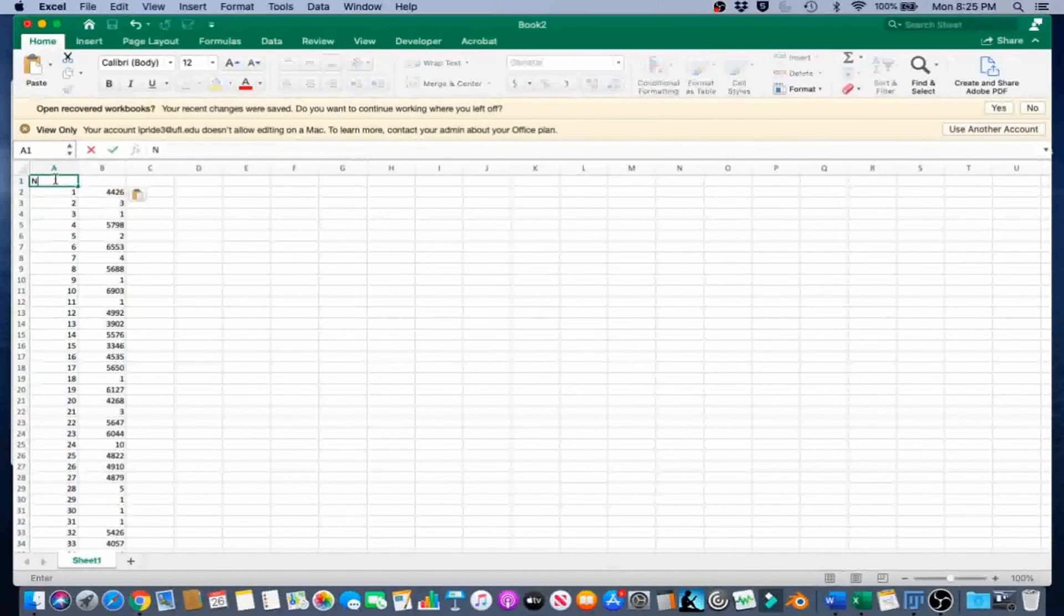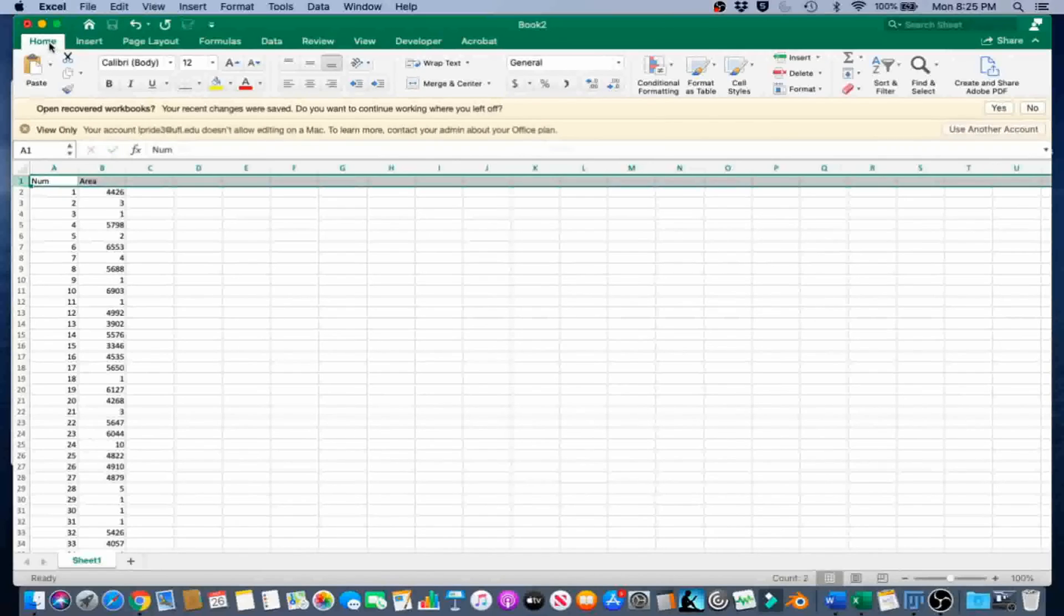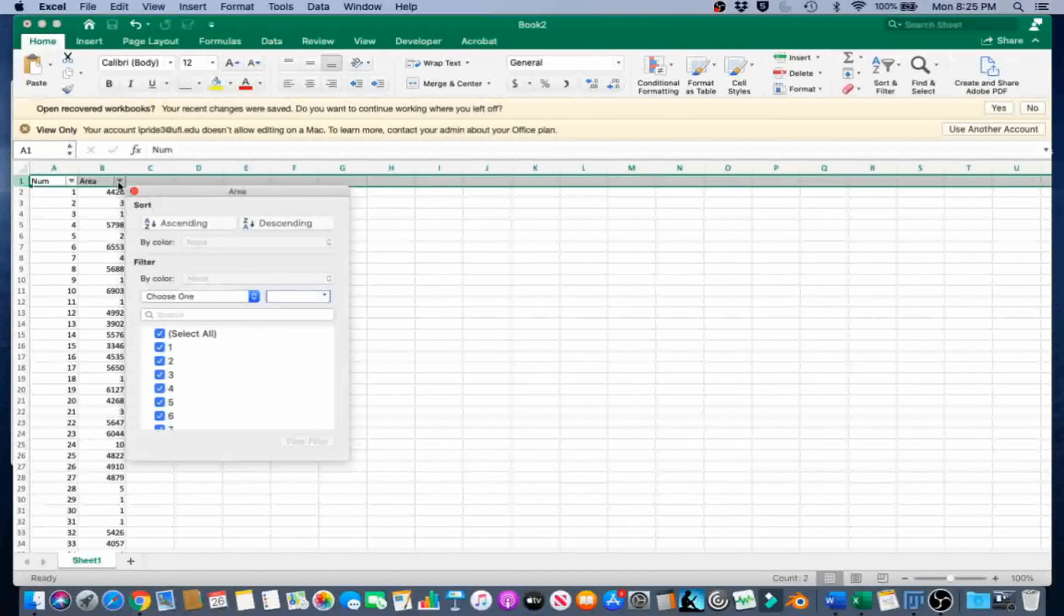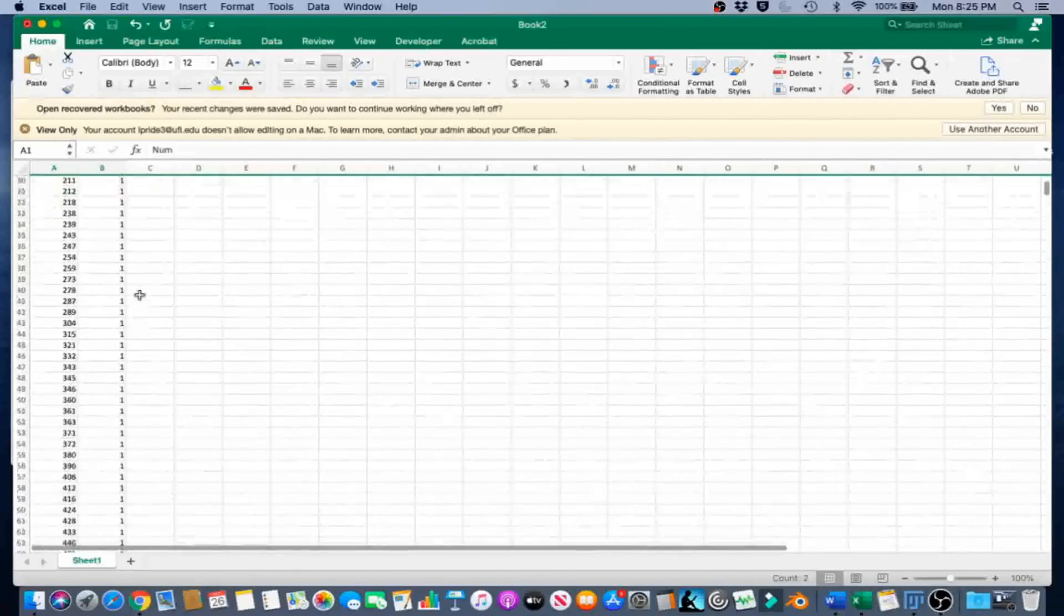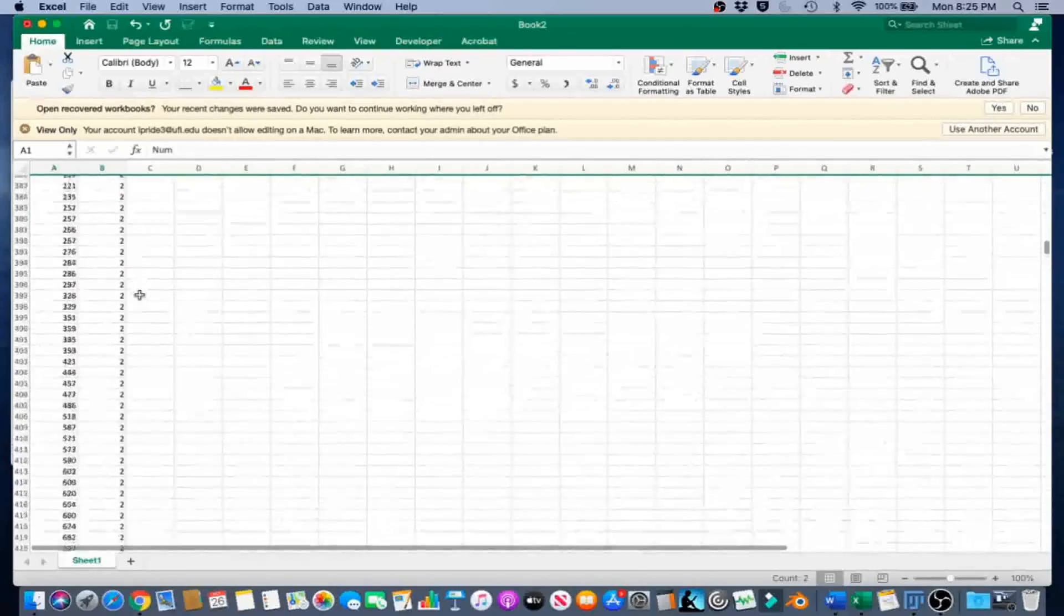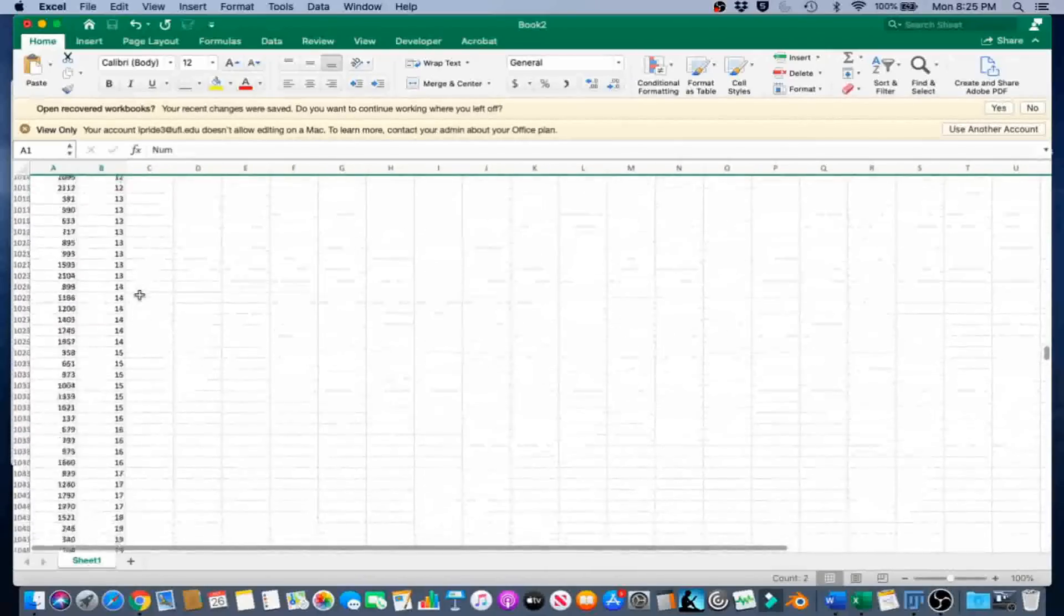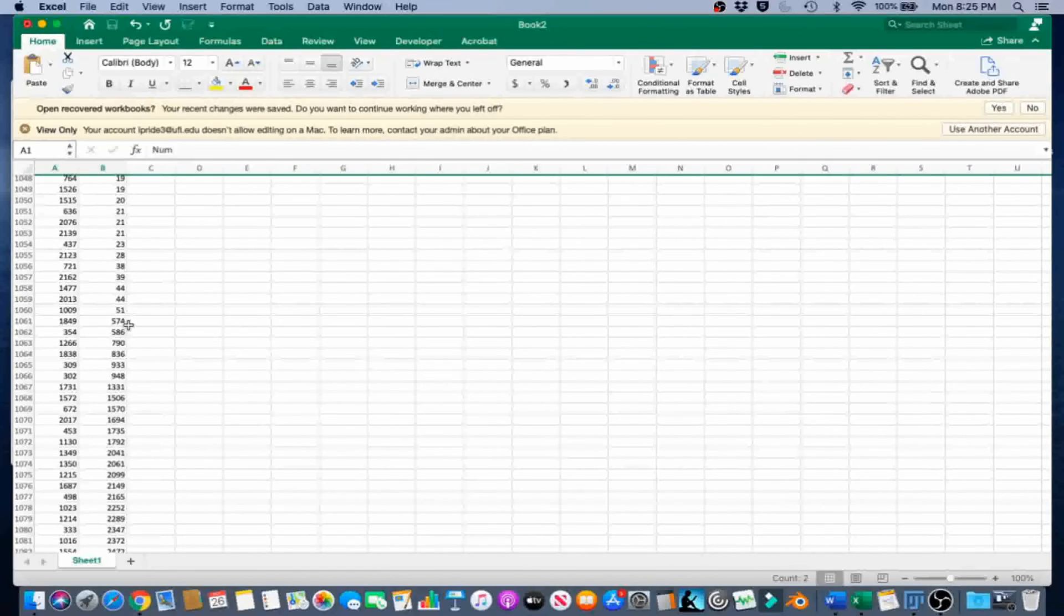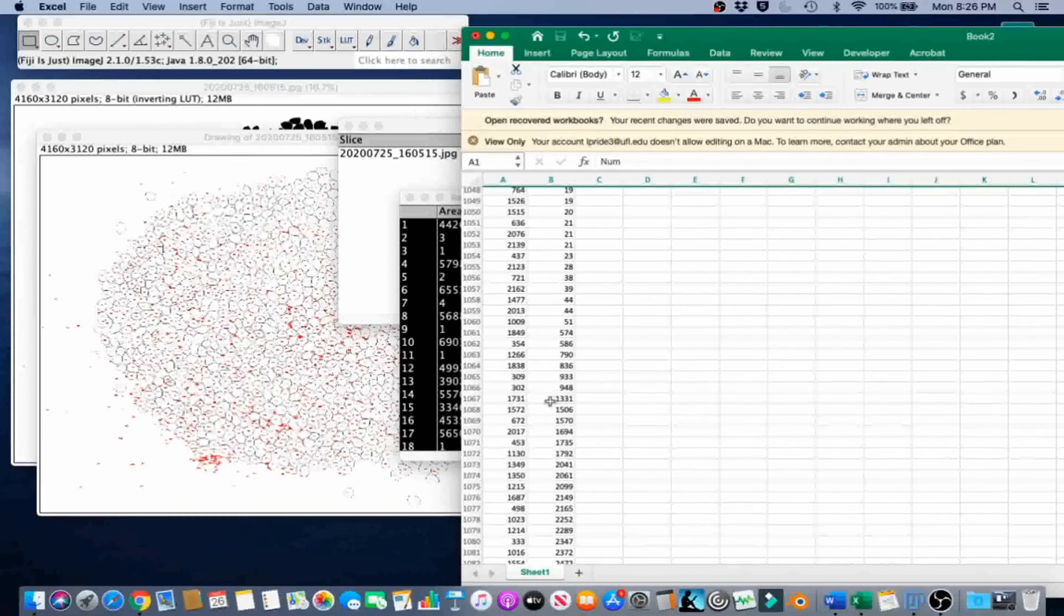I'm going to call this Num. Call this Area. And in the Home tab under Sort and Filter, just go ahead and select Filter. And with the caret on the right, sort ascending. What we're going to do is we're going to look for just kind of like a section that has a gap in the area. So you have a lot of 1, 2, 3 pixels stuff. Then it starts to climb. And then right here we see that it makes a jump from 50 to 574. And then again from 948 to 1331. We're going to go ahead and check out the area 1331.